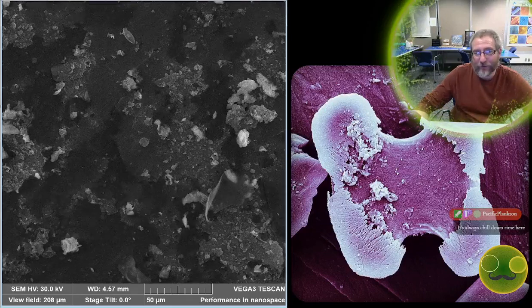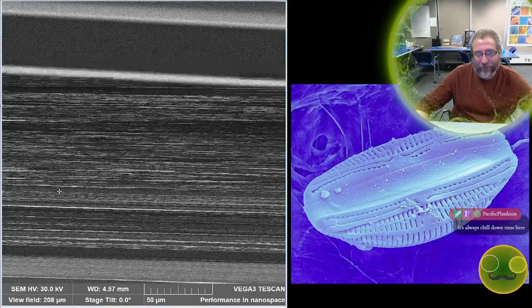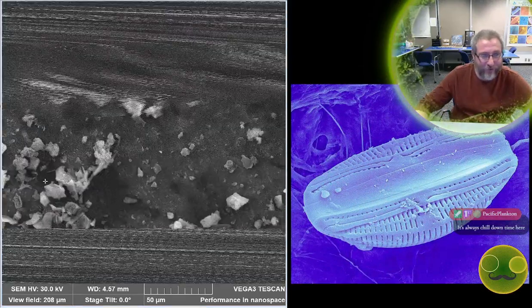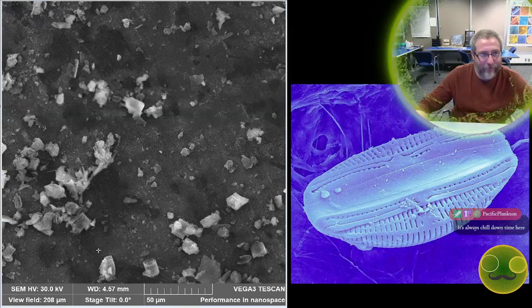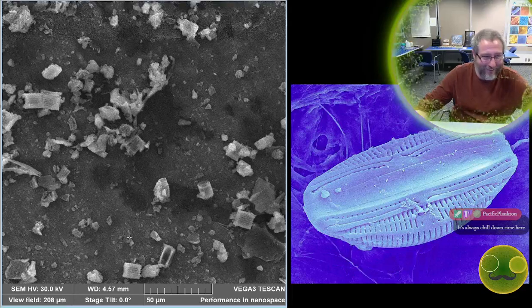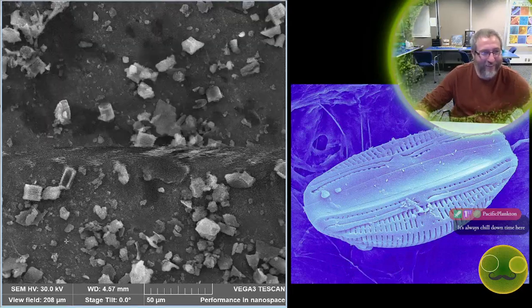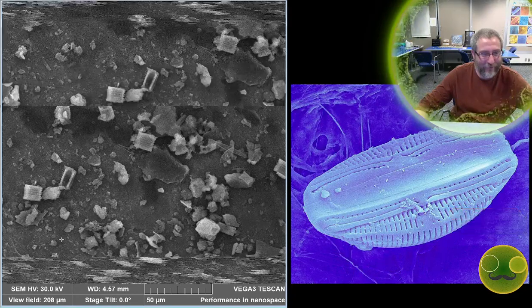Alright, let's jump over to the last stub that I have prepared, which is number 6. And then I'll see, I don't remember what's on this one either. Probably a bunch of diatoms from diatomites and some volcanic ash, if it's like all the other ones. And we'll get some pictures and chat a little bit more, and then I'm going to go home.